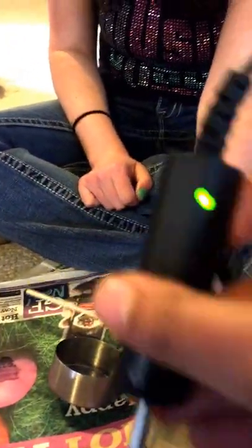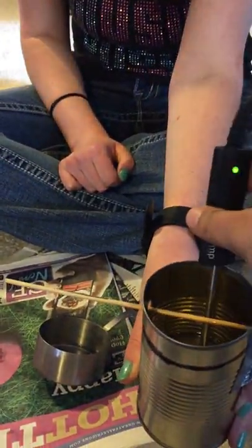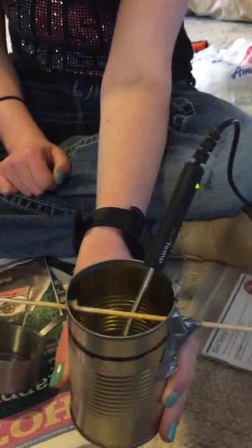We're going to have the initial temperature of the water, which you can see on this program on Sarah's laptop that she's got. So it's 18.9 degrees Celsius. And we would take this out and light the pecan.